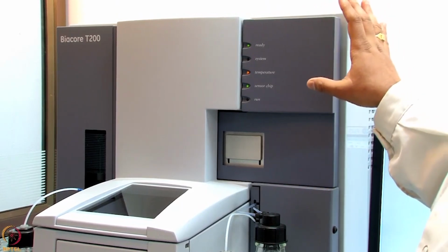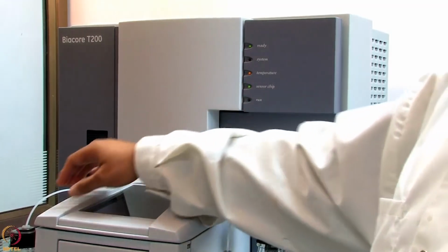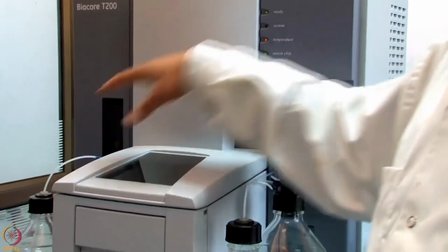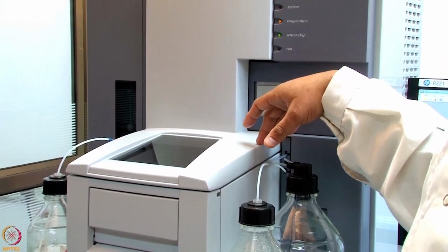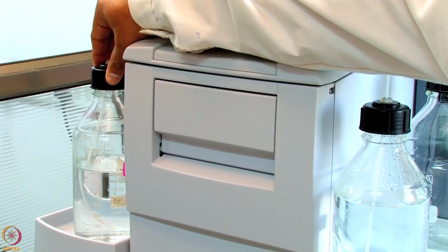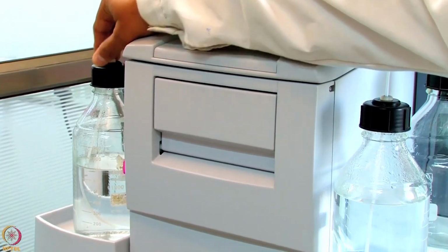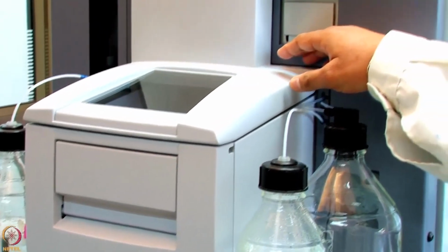So we will now connect a new running buffer here and prime the system before our immobilization experiment. So here the new HBS-EP plus buffer is connected and the new chip will be docked now.